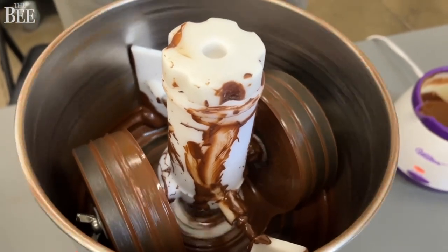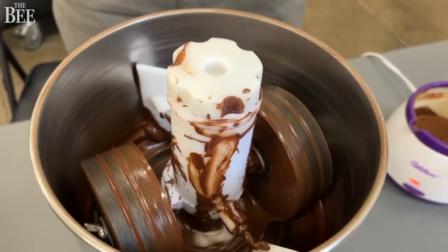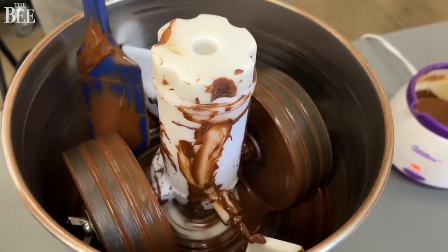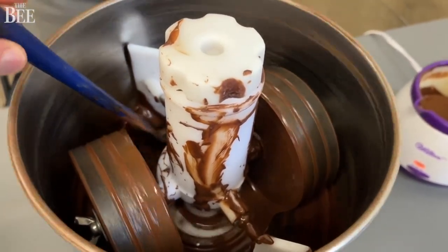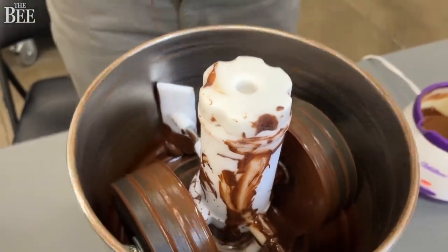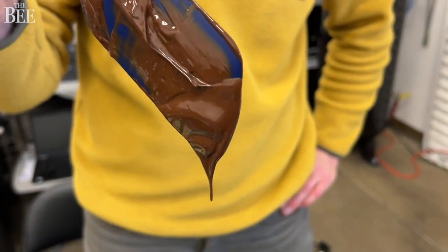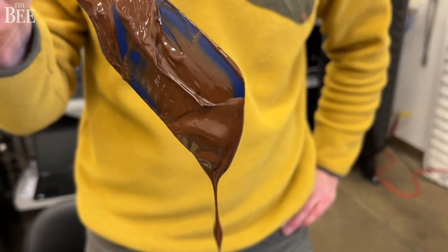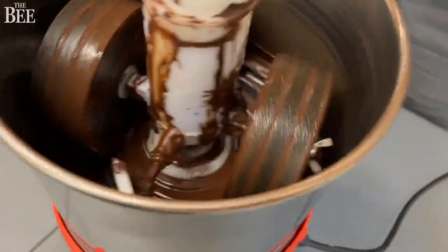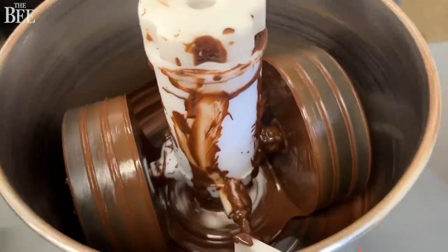After the cell cultured cocoa nibs are finished, we throw them into a melanger, which is a traditional chocolate grinder. This will pulverize the cells over a period of several days, and this creates a fine particle size so that when you eat the chocolate, it smoothly melts in your mouth. You get that nice clean finish that you would find in chocolate.